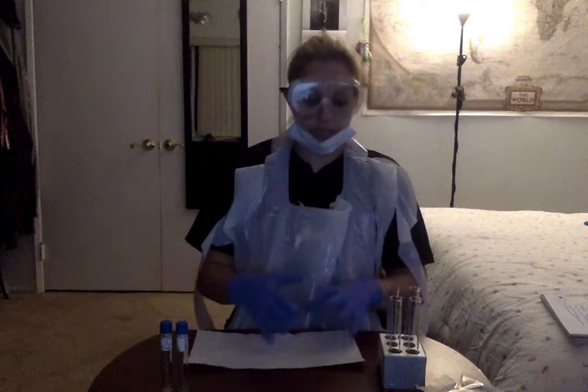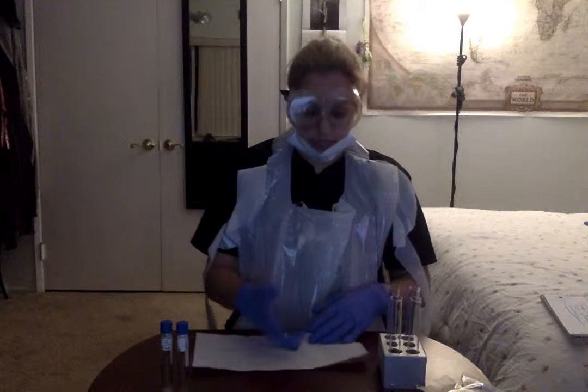My E. coli was the one that actually bubbled really quickly, and it bubbled for a while. It was kind of a clear bubbly, but you can tell it was very oxygenated, basically meaning that it was catalase positive.